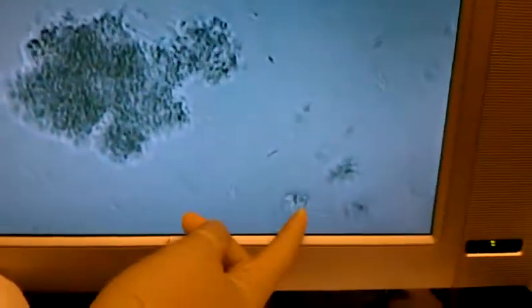There's one right there. You see, we're just focusing on that. Fine tune it. You can see what's going on in that. Millions of little parasites just floating around. I know it's kind of nasty to think about, but see, they move really fast. And they just form, like, this was probably a rosette on its own, and it formed in like that. As long as these other little clumps were probably just rosettes of their own, and they formed in.